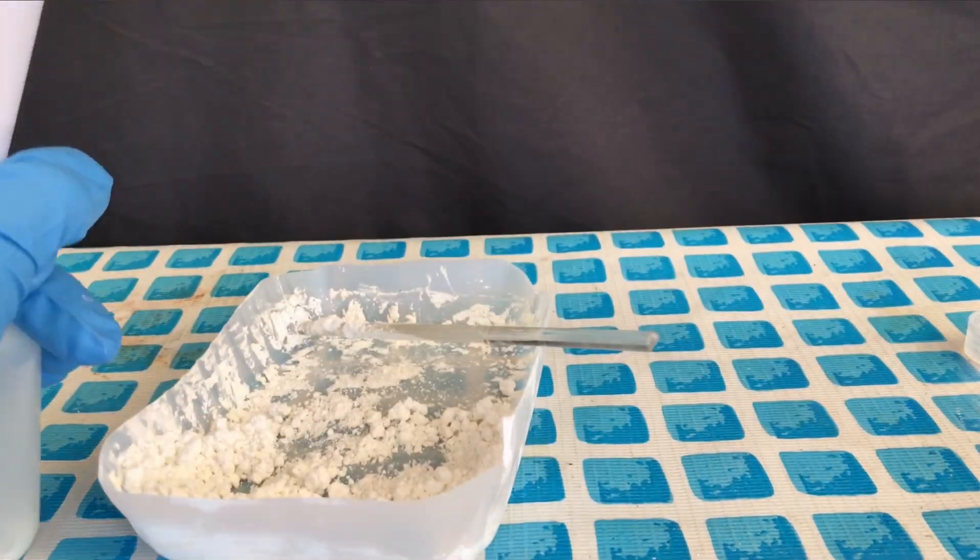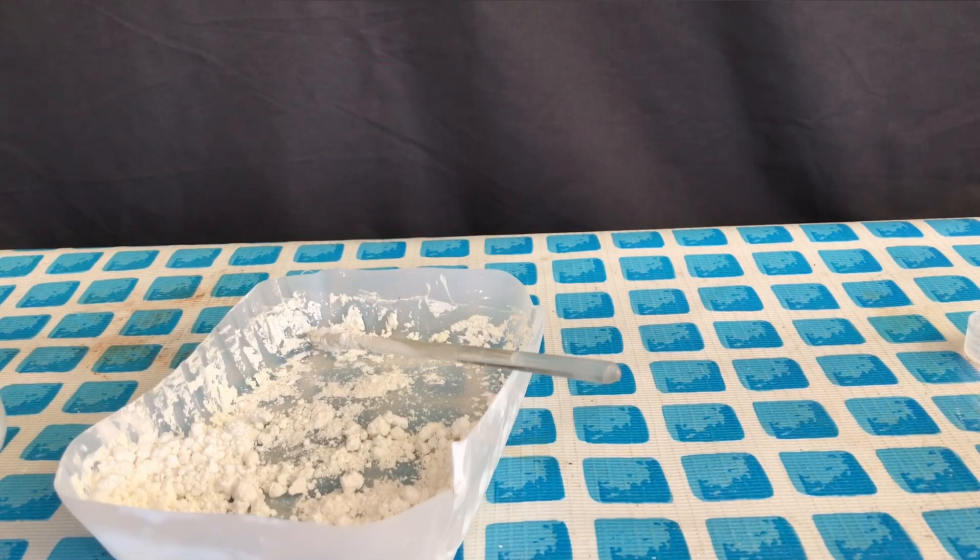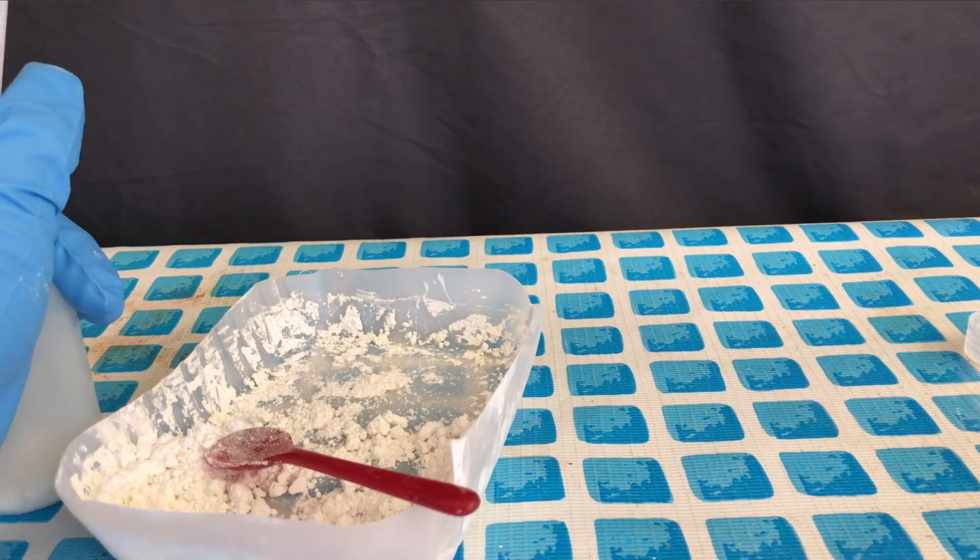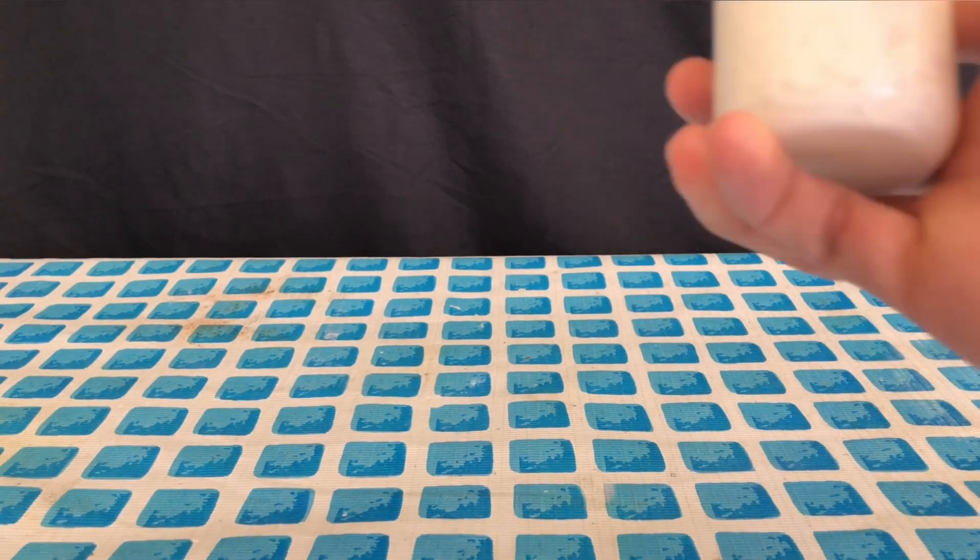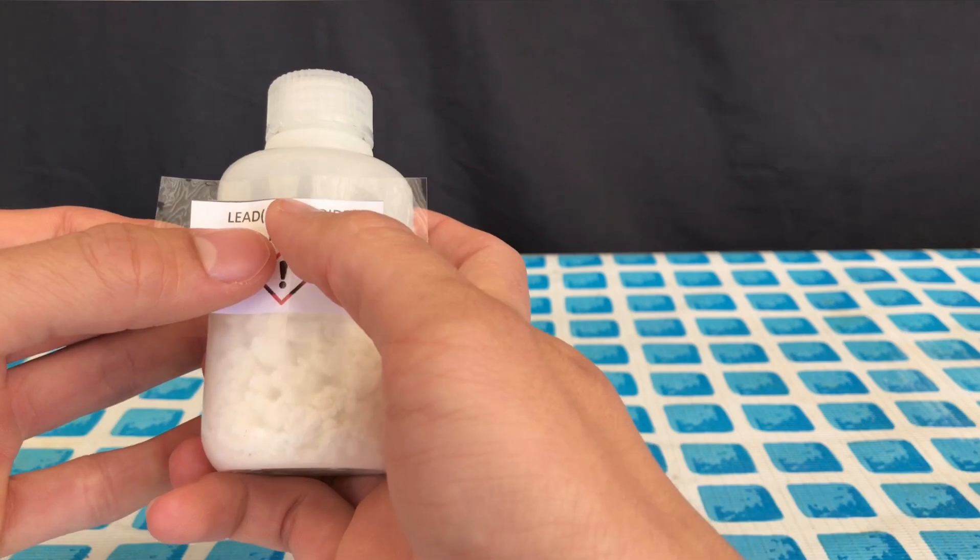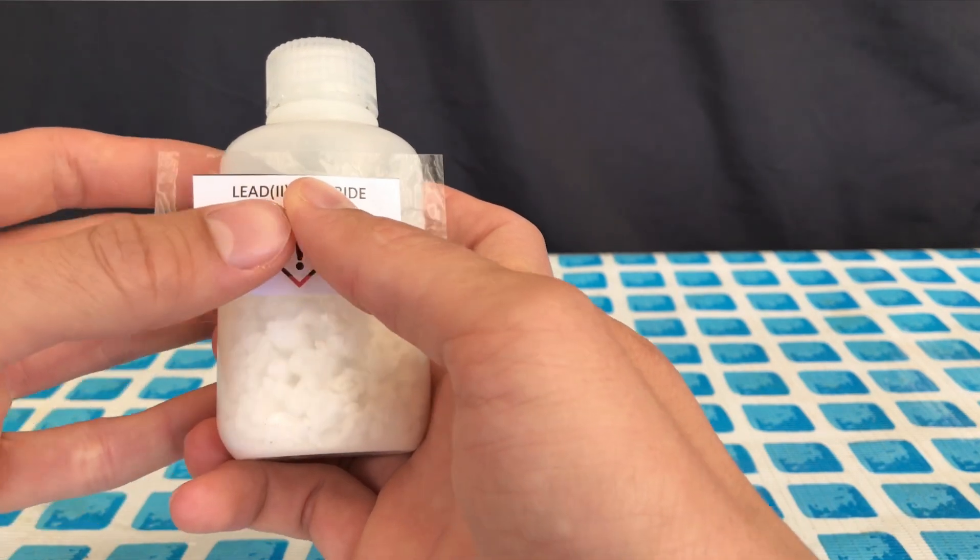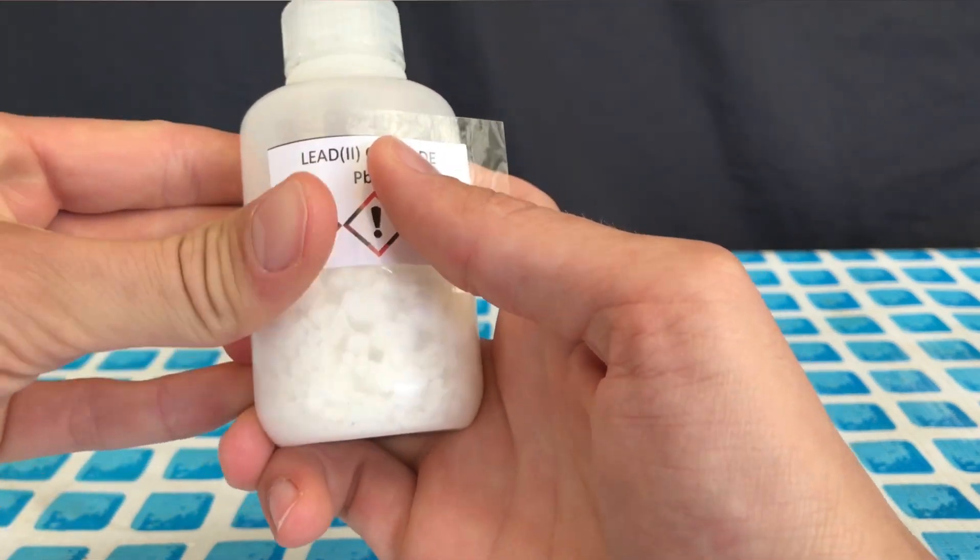The lead(II) chloride was broken up using a glass stirring rod and afterwards it was transferred to a pre-weighed bottle. The bottle was weighed again and we ended up with 114.6 grams of dry lead(II) chloride which is contaminated with a few flies.